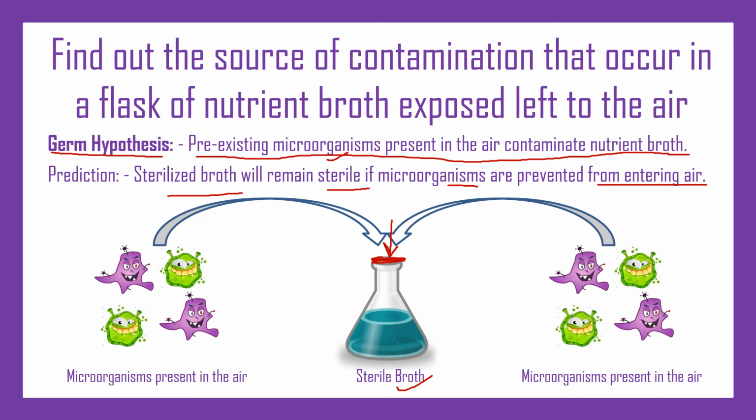But if we remove this prevention, then air could go inside and microorganisms could come inside and grow in this nutrient medium. So we have to test this, that what will happen in both the conditions, right? So this is the hypothesis and how we have predicted that.